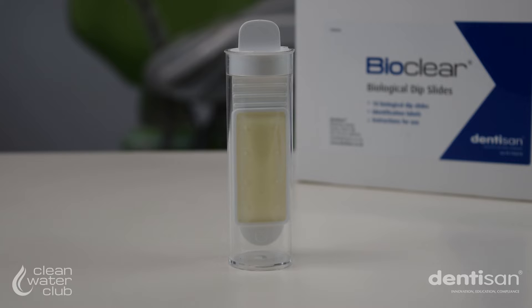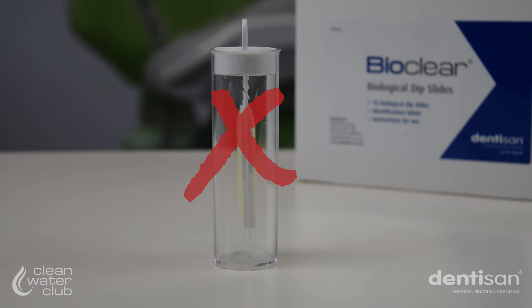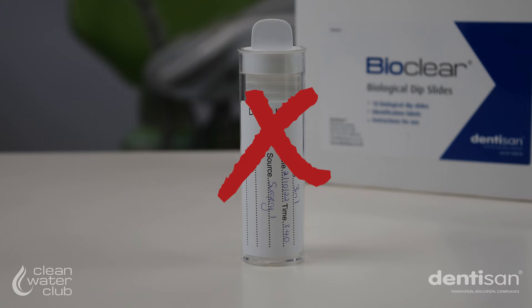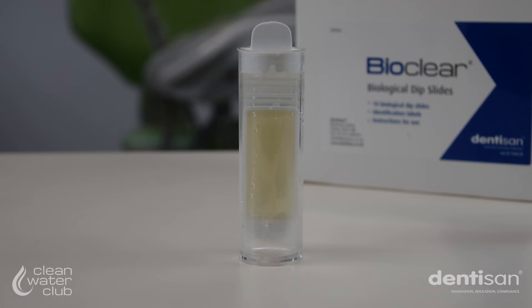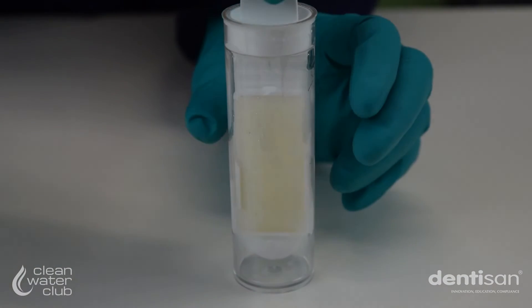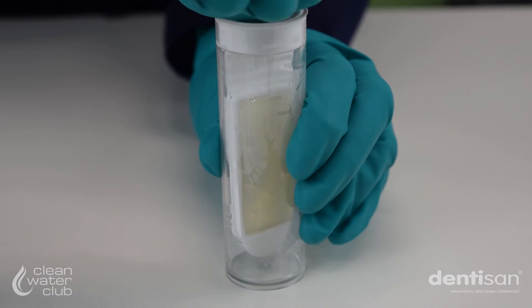Each photograph should show the paddle face on. If the paddle is sideways, it cannot be seen properly and will be rejected. Make sure the image of the paddle is not obscured by a label. Condensation in the container can obscure the image — twist the paddle in the container to remove condensation from the inside before photographing.